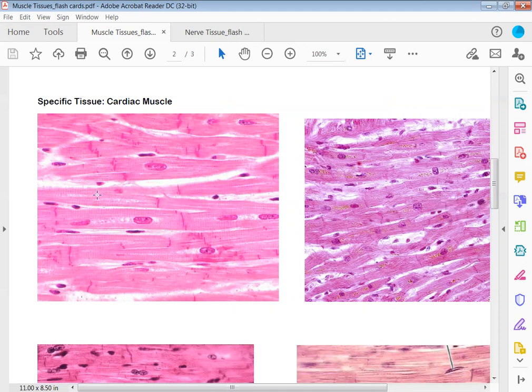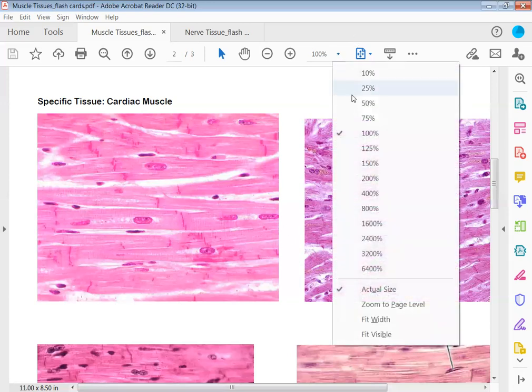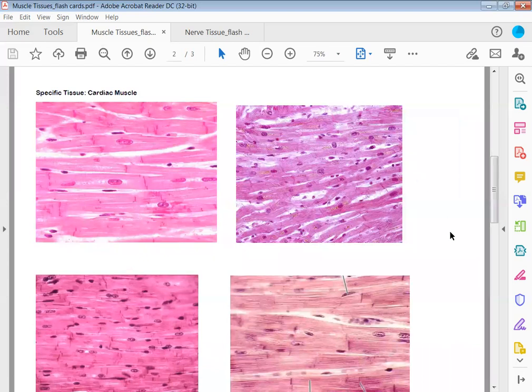So again, this tissue has branched, smaller, thinner fibers. The tiger striping or banded effect is called striations. The dark line structure is called the intercalated disc, and the roundish dark structures are your nuclei. The big tissue category for this is muscle tissue, and the specific tissue is cardiac muscle.